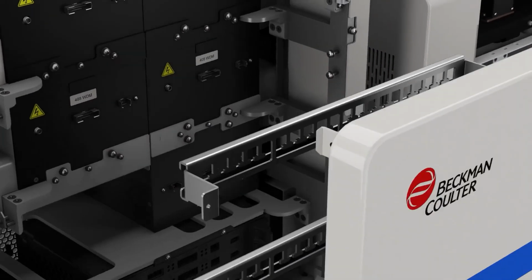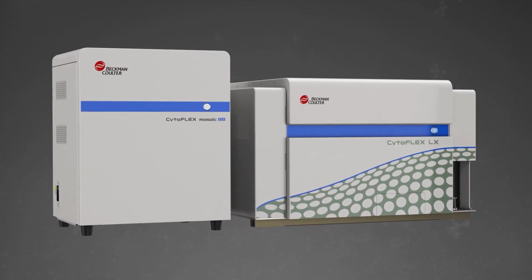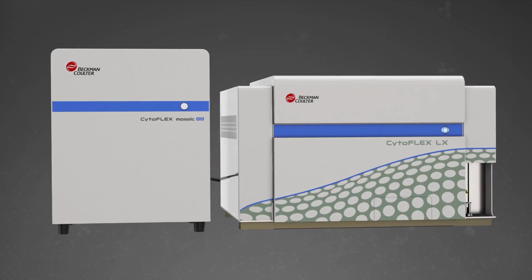I am thrilled about this next stage for Beckman Coulter Life Sciences. I'm personally excited to empower researchers worldwide with the flexibility and ease of use that our CytoFLEX instrument now offers for spectral experiments.